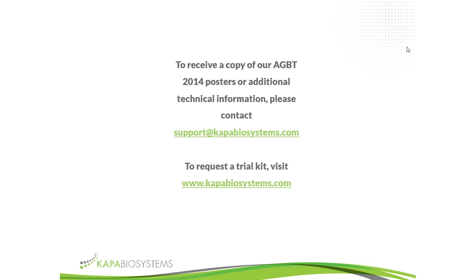So Marika, have you done any work to compare the Hyper Prep kit with the Illumina Nano, and are there differences you can share? Yes, so we have done some comparative analysis for libraries prepared with both good quality and FFPE DNA. In general, what we do see with the Hyper Prep kit, as well as our existing library preparation kit, is higher yields of adapter-ligated library.